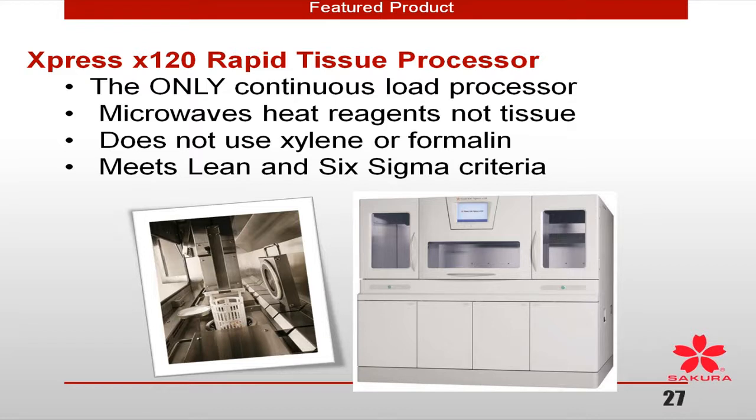When using the dissection tools to cut 2mm slices for the Express, was there an initial resistance to dissection? Absolutely. It's a change in process, but here's a couple of things that can help you. If you are a combination lab, and let's even say you're a resection lab, where most of your tissue samples are resection, you're probably only going to have to use the precision tools about 30% of the time. Several samples are easy to meet that criteria, such as a gallbladder or an appendix, where it's easy to create that 2mm or less.